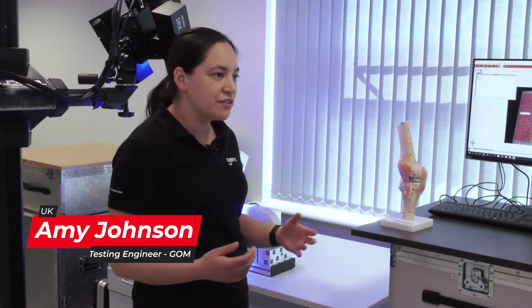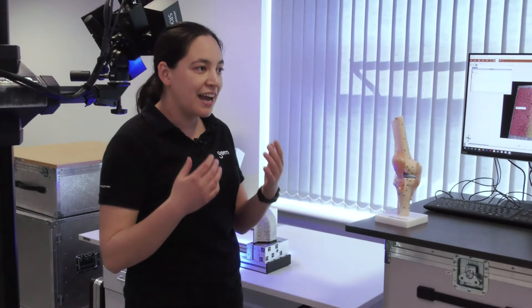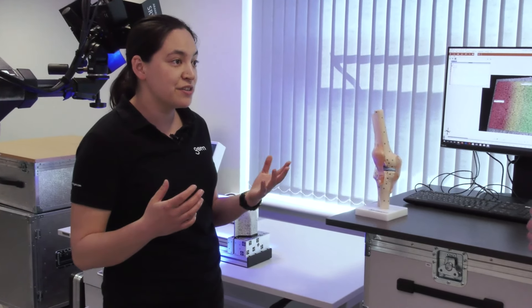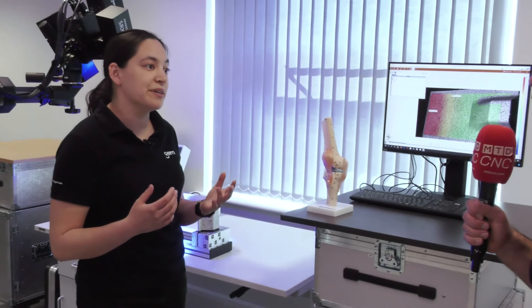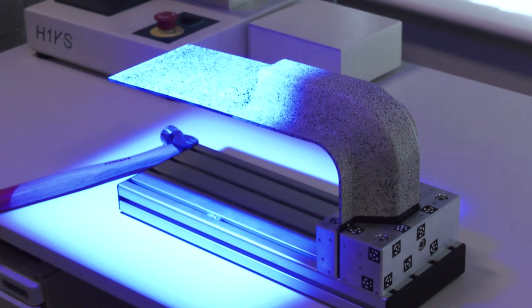The main product in the GOM testing portfolio is the Aramis system. It's a system that basically measures customers' tests using a principle called DIC, or digital image correlation. Can you go into a little bit more detail about what that means?